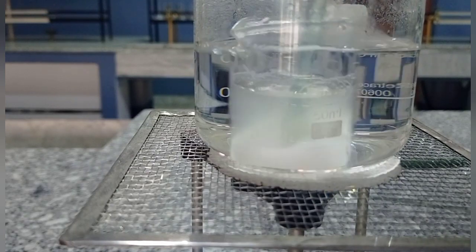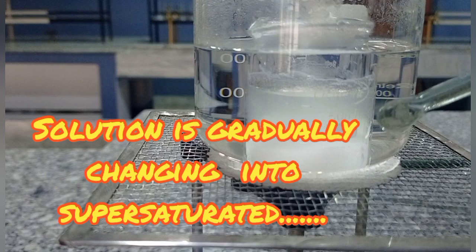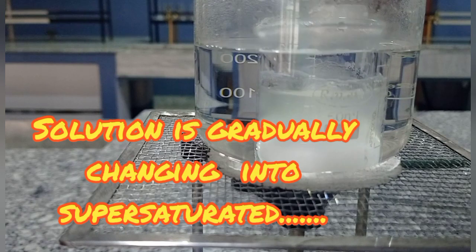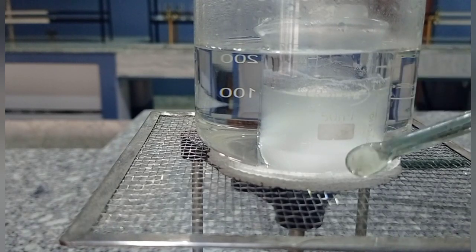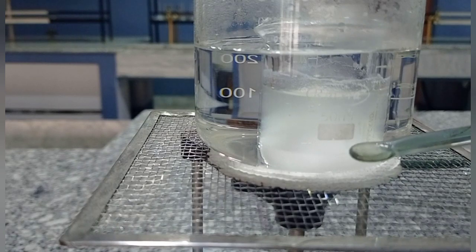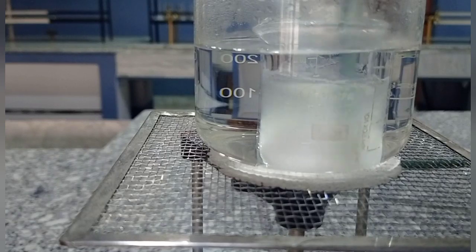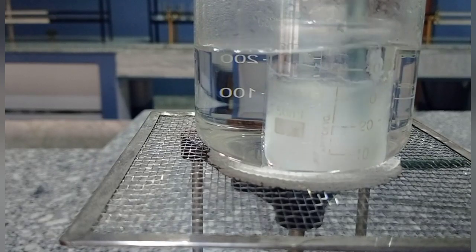You can see that already a huge amount of salt has dissolved into it. Now the temperature of this has also gone high enough. I have used boiled water just to show you how gradually the temperature of the solution increases and how gradually the salt is getting dissolved. You see, the more the temperature is rising, more amount of salt is getting dissolved.